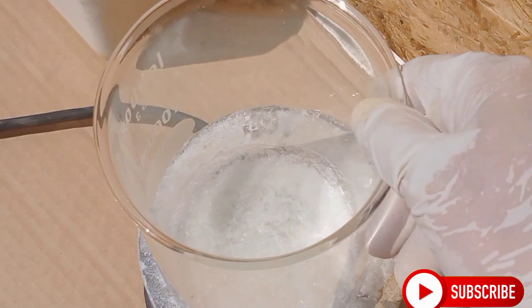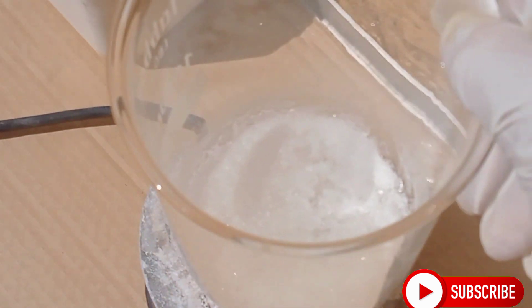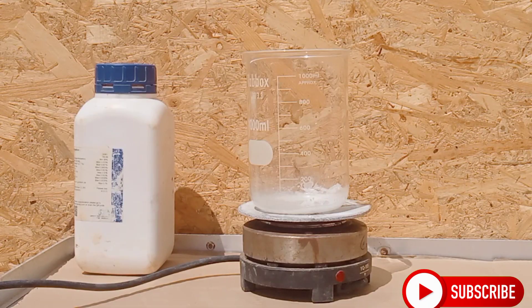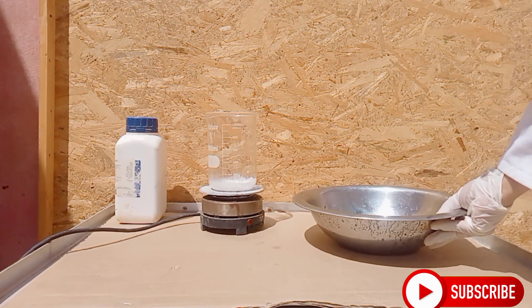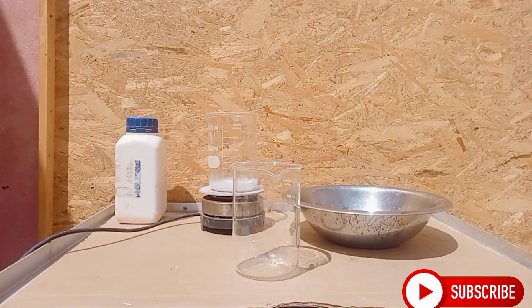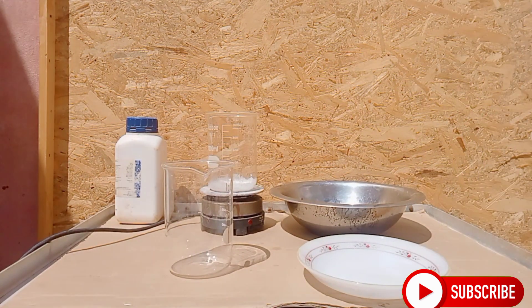After 3 and a half hours I got this result, so I'll let it heat up for a while to get a better result. Transfer the sodium chlorate to another cup, then put it in a bowl of water to cool. Thus, we get a good usable product.